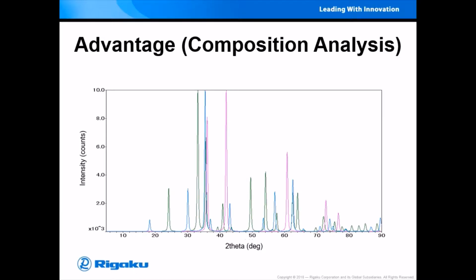When we measure the sample of the previous slide, we can see 3 patterns of chemical compounds: FeO, Fe2O3, and Fe3O4 superimposed in the data. And then we can identify each substance by comparing both patterns of the sample and the PDF card using computer programs.